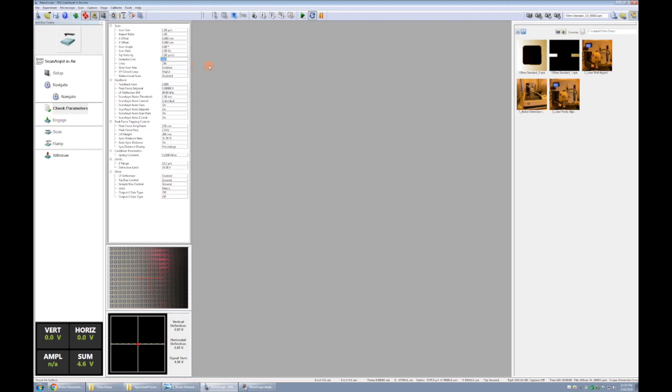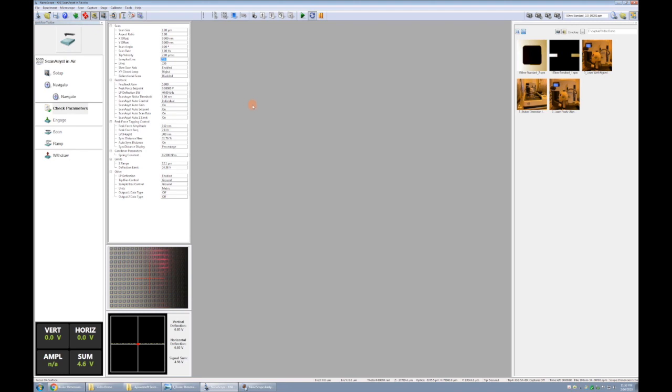Samples per line, that just means the number of x pixels across your field of view. Right now at 256 pixels and one micron, each pixel is about four nanometers. You don't really want each pixel to be much less than the practical resolution that you can achieve on this microscope. Really about a two nanometer pixel size is about the smallest that I would try to go to. Anything smaller than that, and you're not really getting the resolution that you're asking for.